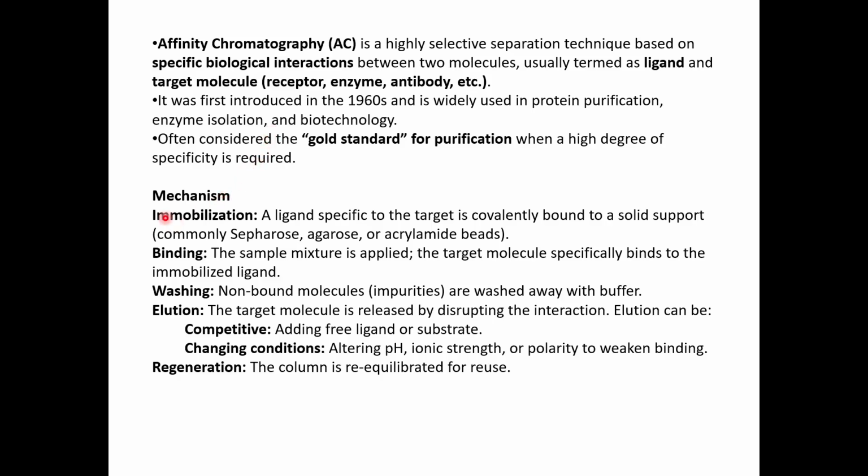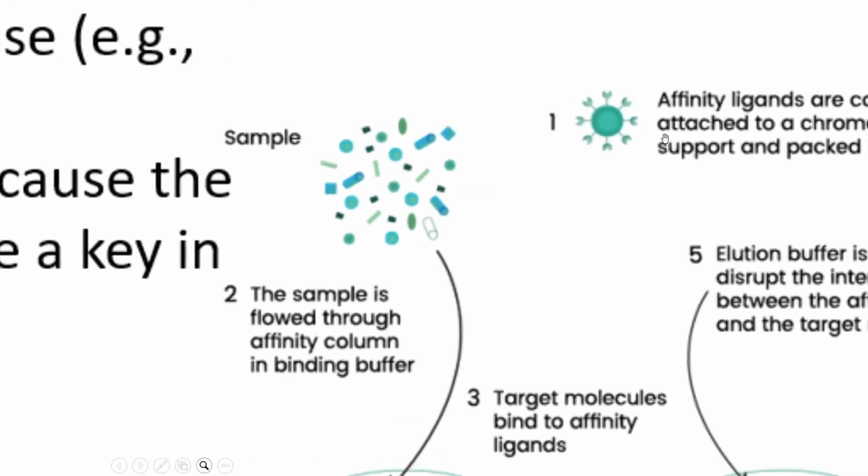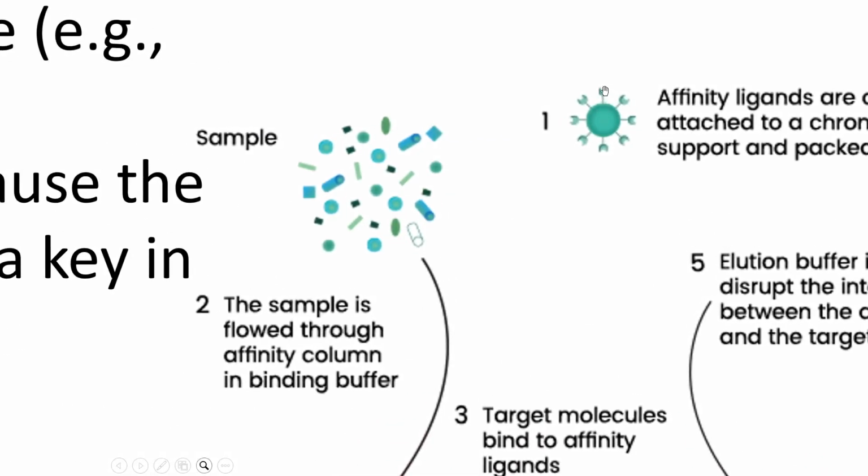So the mechanism, like we discussed, is immobilization. A ligand which is specific to the target is covalently bound to a solid support, which, like we discussed, is your stationary phase, which is your beads: agarose beads, sepharose beads, or acrylamide beads. So you can see here your bead is attached to the ligand, which will be specific to your target.